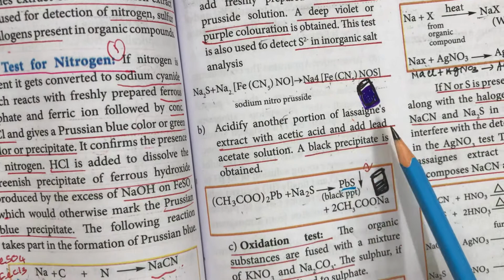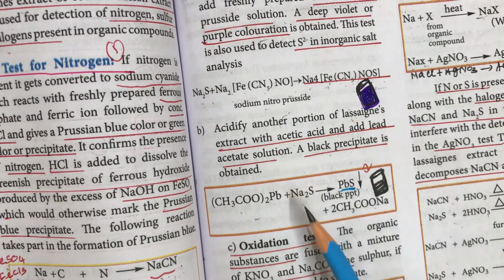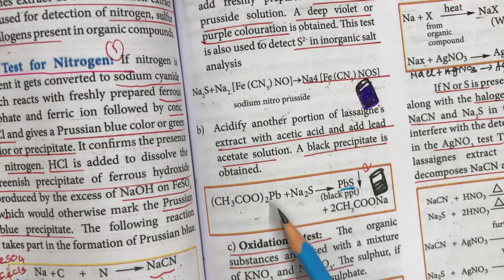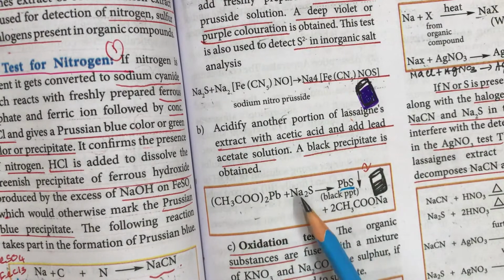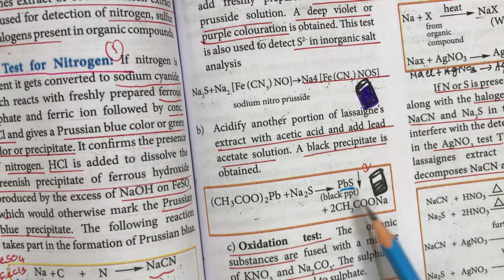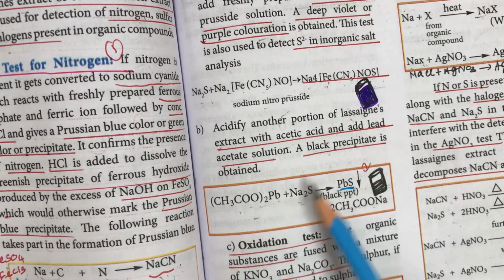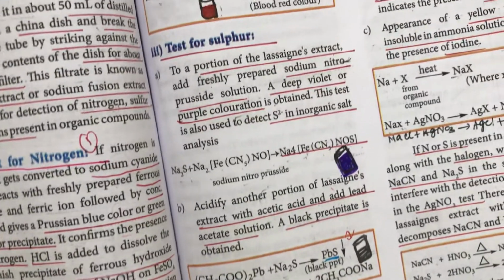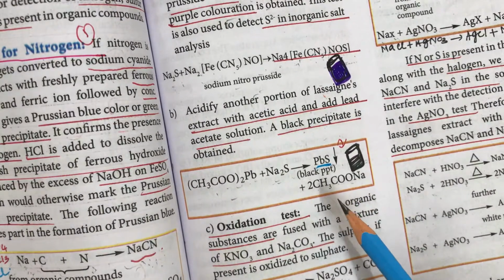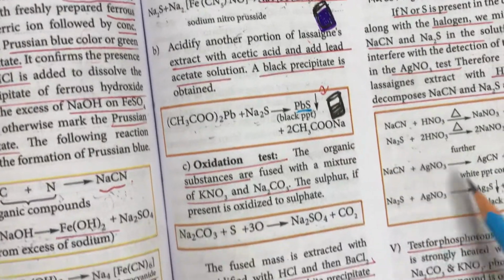Another portion of the Lassaigne's extract, to identify sulfur, is treated with acetic acid and lead acetate. The sodium fusion extract containing sulfur in the form of sodium sulphide reacts with the lead acetate. The sulfur and lead combine, forming a lead sulphide black precipitate. So, the formation of a black precipitate of lead sulphide shows the presence of sulfur in an organic compound. So, these are the two tests: sodium nitroprusside violet coloration, and the addition of acetic acid and lead acetate giving a black precipitate, which show the presence of sulfur in an organic compound.